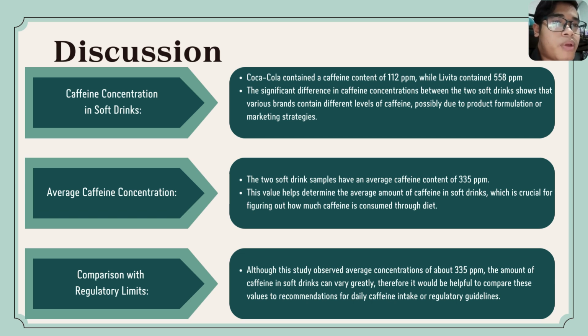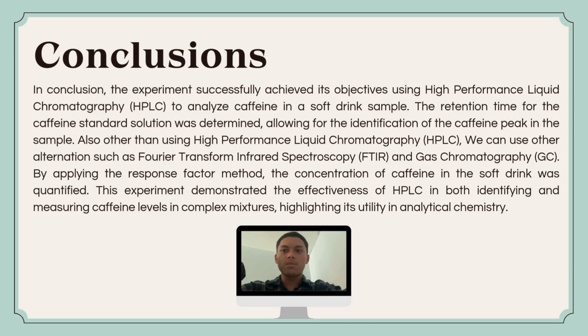The last one is comparison with regulatory limit. Although this study observed an average concentration of about 335 ppm, the amount of caffeine in soft drinks can vary greatly. Therefore, it will be helpful to compare these values to recommendations for daily caffeine intake or regulatory guidelines.